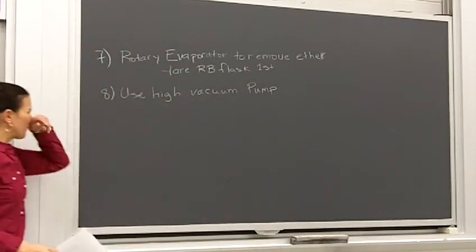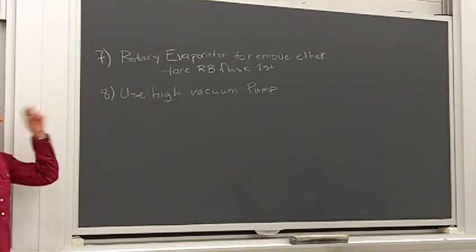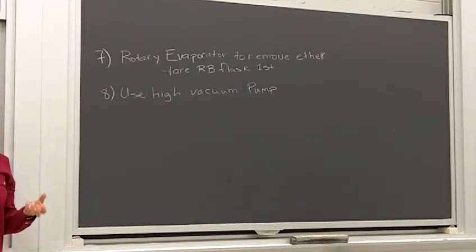So there's number of steps in our workup to get down to our final product, all right? And then you can just store your product in the round bottom flask that you rotovapped in. What I would do is not use your 50 ml round bottom flask because you're going to use that next week. I believe that's the one we use. We'll double check. It's either your 25 or your 50.